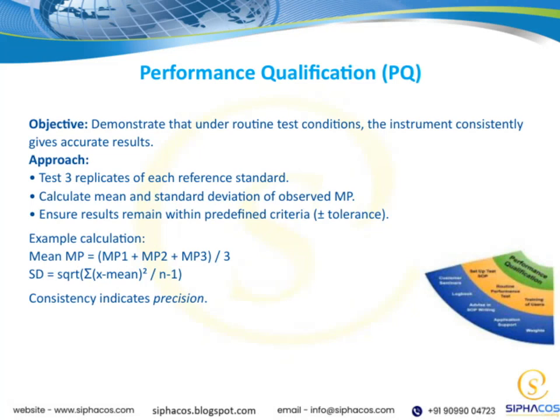Now let's discuss performance qualification, or PQ. The main objective here is to demonstrate that under routine test conditions, our instrument consistently provides accurate results. To do this, we perform a series of tests, specifically, testing 3 replicates of each reference standard.